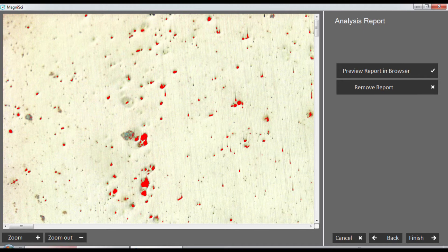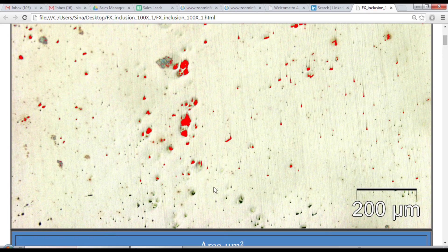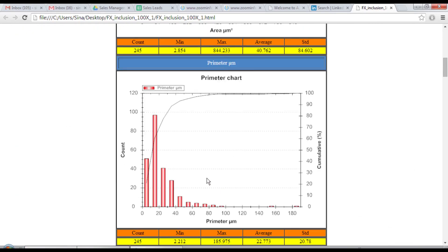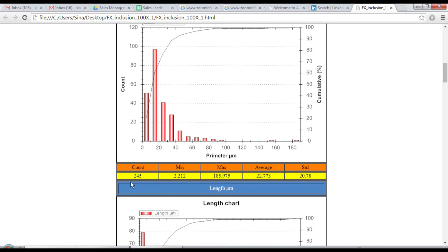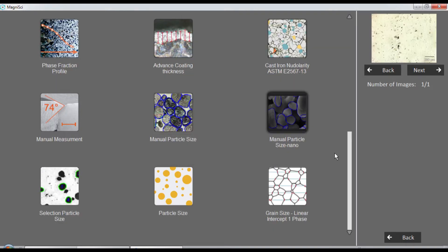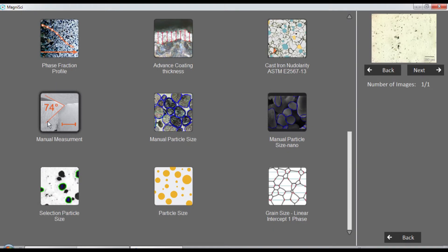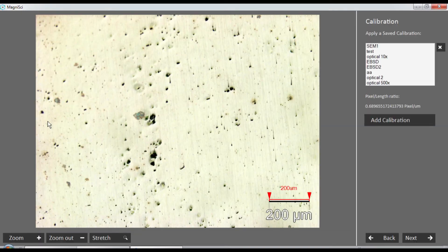We just need to know this number, which is basically 245 particles. Now we need to know the area of the image, so we go to another tool - the measurement tool.